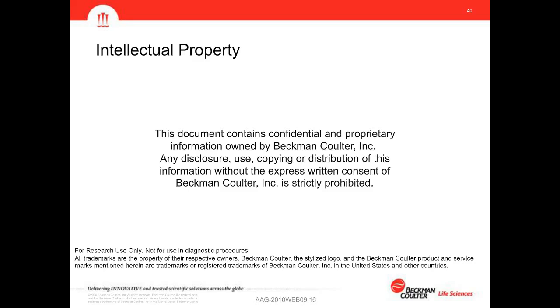And then we have the different layers of data that are there. Each have a property called pipettable. And if pipettable data is set to true, then the software, in this case virtually, copies that information into the tip, and then any place where that sample is transferred, then that data is also attached to the destination well.